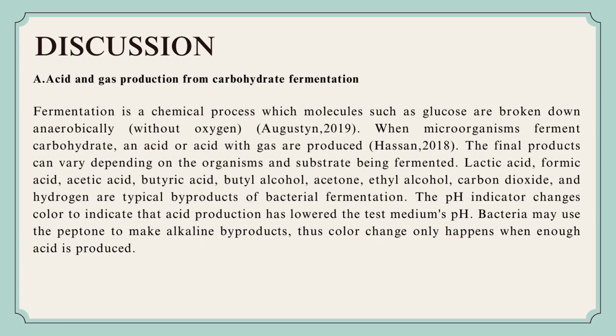Discussion: acid and gas production from carbohydrate fermentation. Fermentation is a chemical process in which molecules such as glucose are broken down anaerobically. When microorganisms ferment carbohydrate, an acid or acid with gas are produced. The final products can vary depending on the organisms and substrate being fermented.